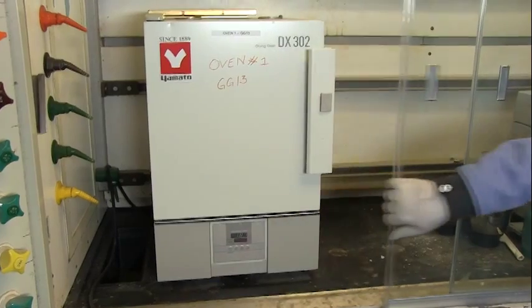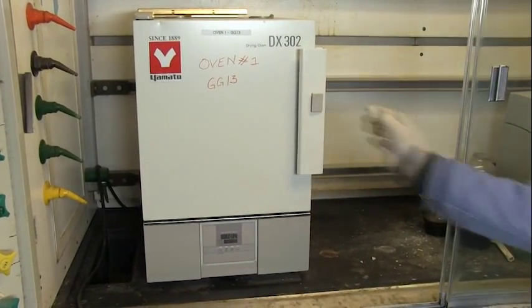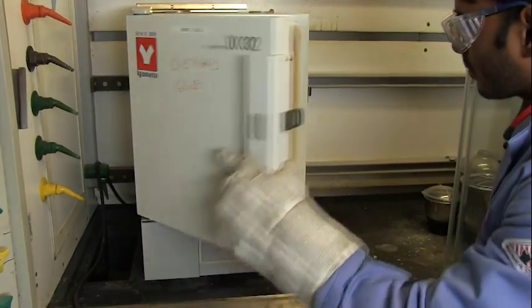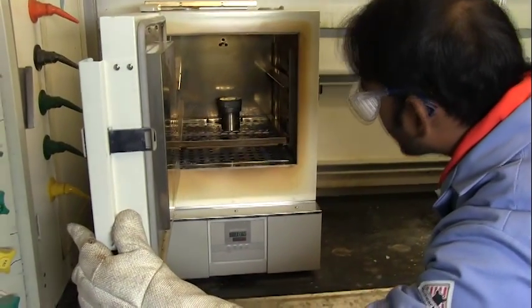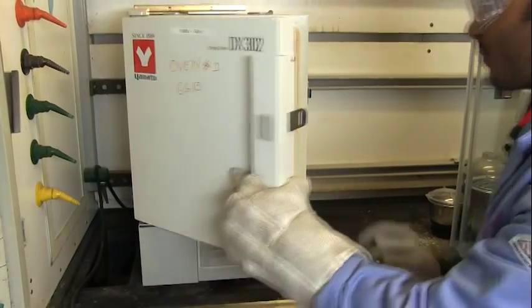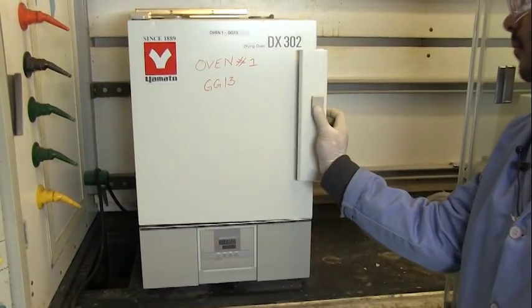Summer students and students from other laboratories who borrow chemical reactor pressure vessels are the least familiar with safe operation. Novice users must be directly supervised in experimental design, vessel assembly, and temperature setting until they exhibit full understanding and proficiency.